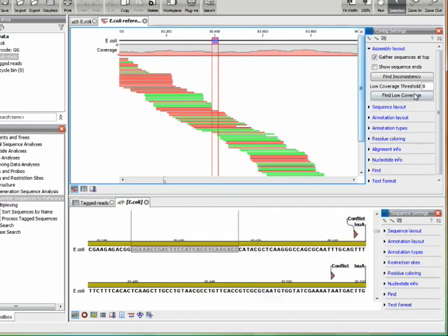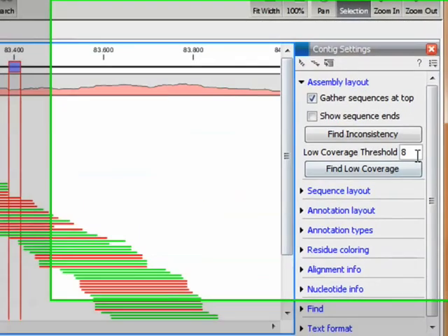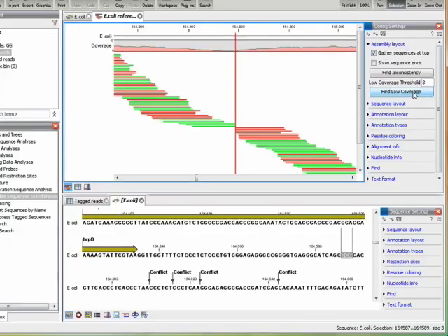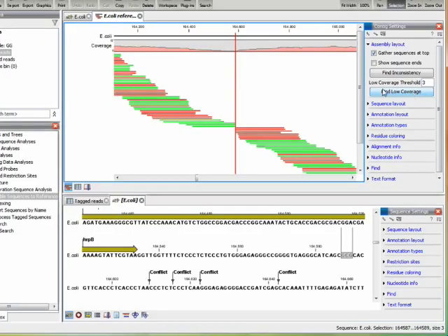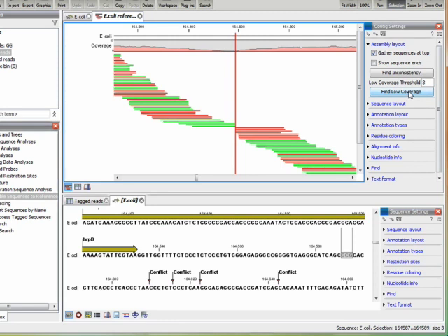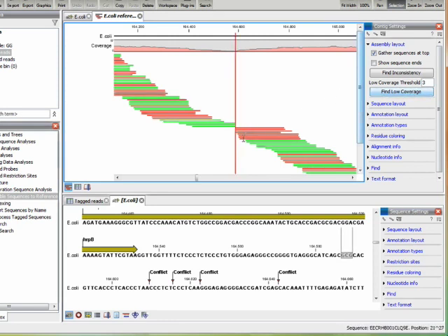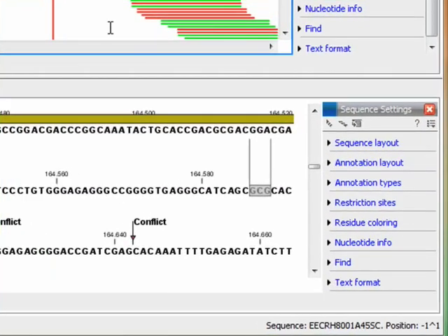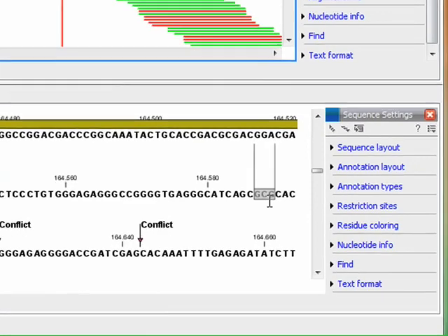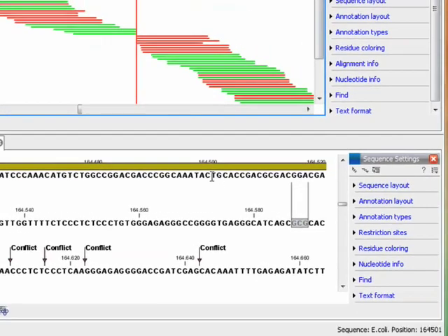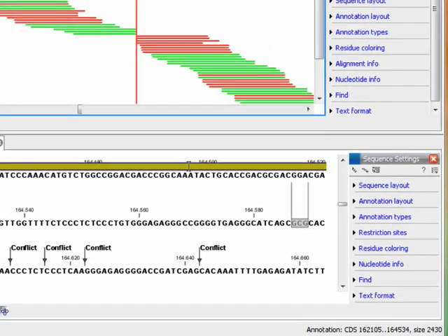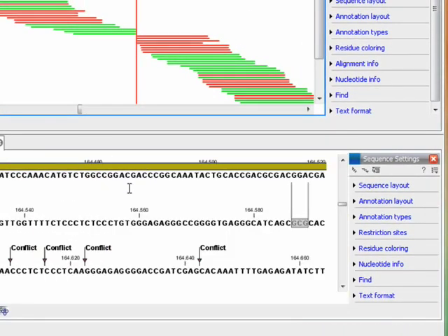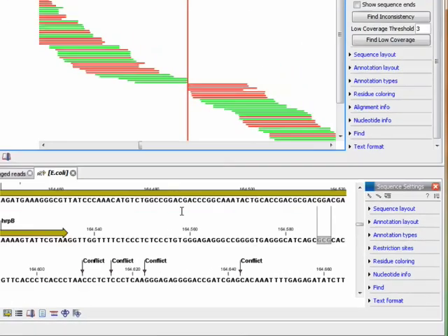Let's try to find some low coverage regions. You see that if we set a threshold of three, we find just one low coverage region, and it turns out to be a triplet outside of any coding regions as defined by the NCBI annotations. So probably the sequence DNA is functionally identical to the reference.